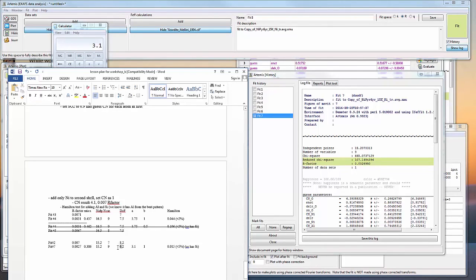The degrees of freedom is 6.2 for the better fit. Divided by 2 is 3.1. And we added 2 free parameters, so 9 minus 7 is 2, divided by 2 is 1. And some of these values I changed, so don't pay attention to all these up here.